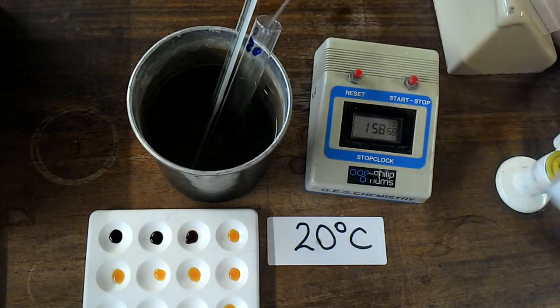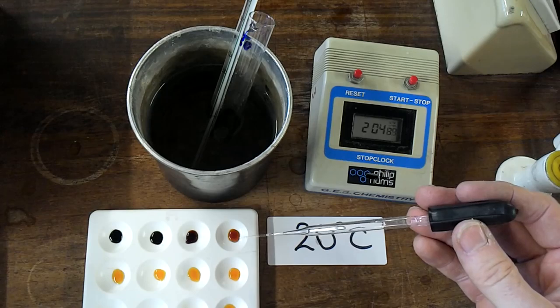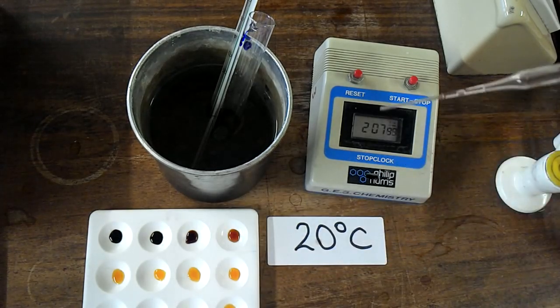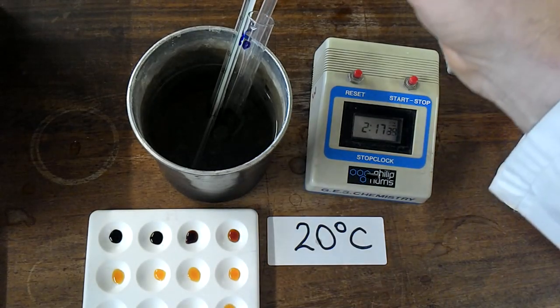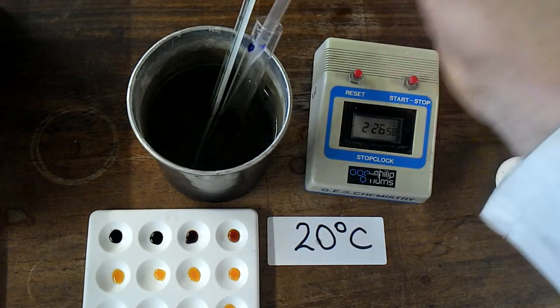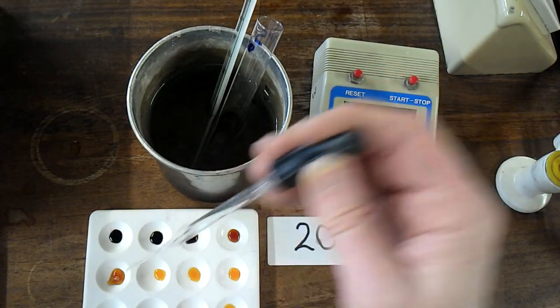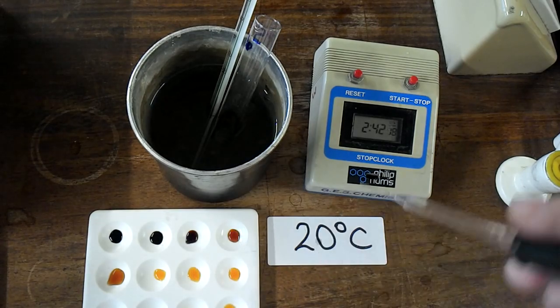Okay, there we go. Now this is still brown, a little bit brown, but much less so. The difficulty with this experiment is you're going to need to decide when is the end point, when you are no longer seeing a change. So we'll do one more and we'll compare it. Right, so now I think there really isn't a significant change there. It has changed slightly, so I would say we've done 1 minute, 2 minutes. 2 minutes it's done.